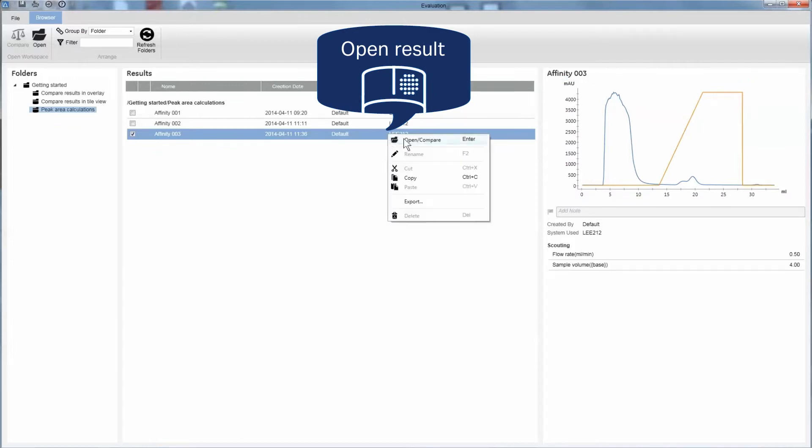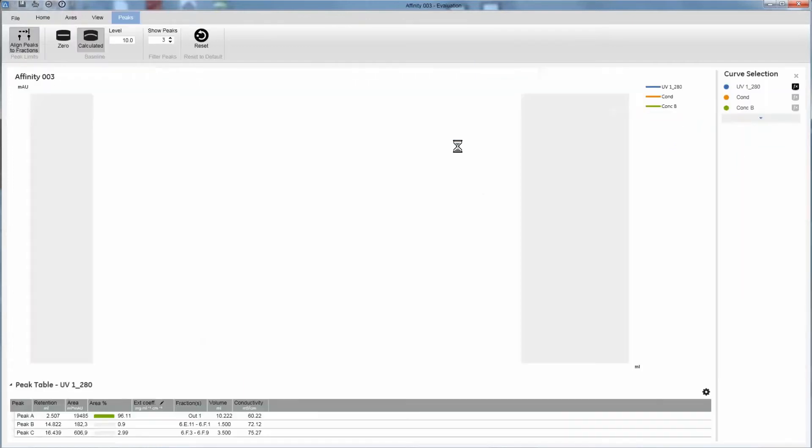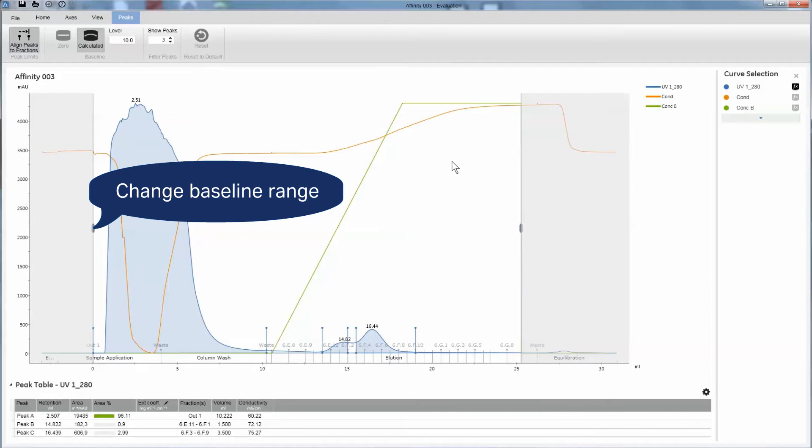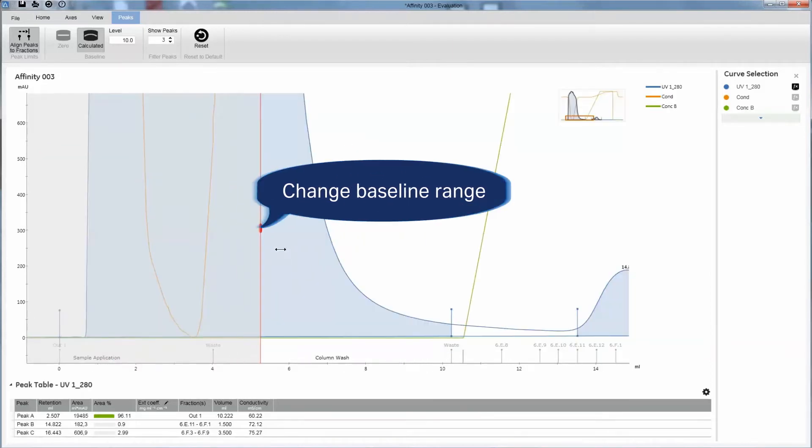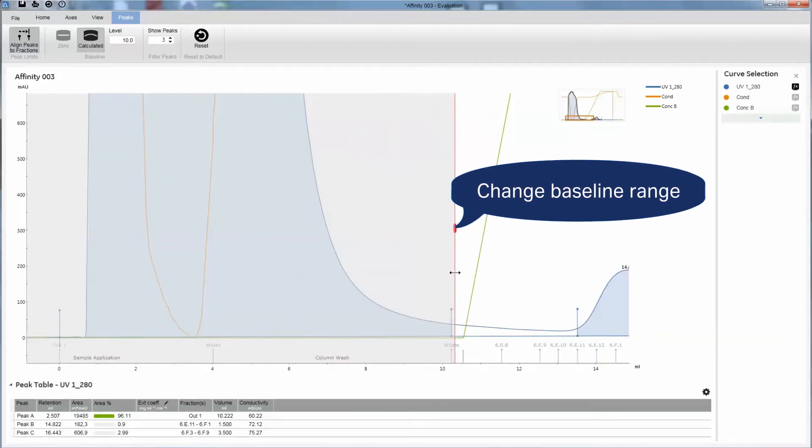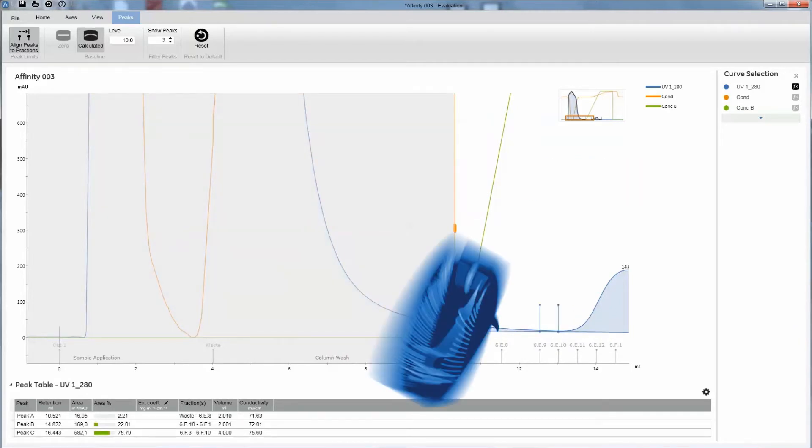Click to open the result you wish to work with. Change the integration window by moving the limits to where you want them. The baseline will then be automatically updated.